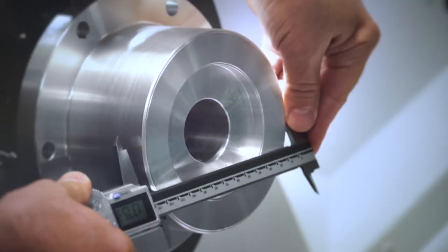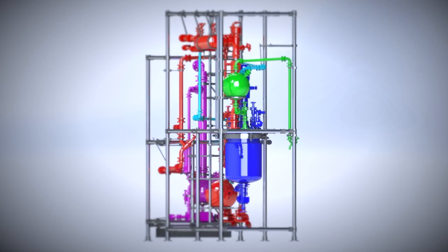It's magic. No, it's meticulous engineering. Glass or metal. We develop exactly what you need. Customization comes standard. It's that simple.